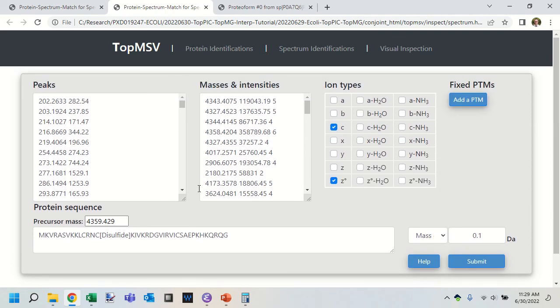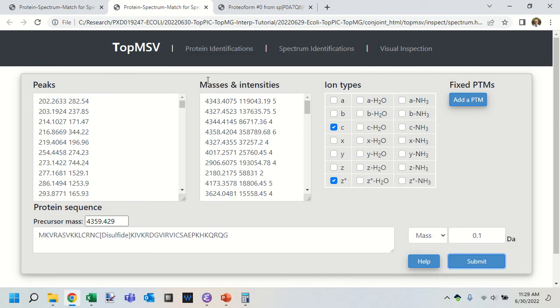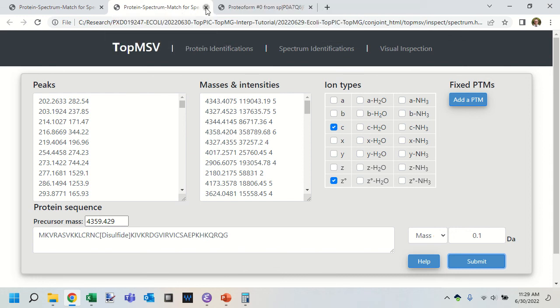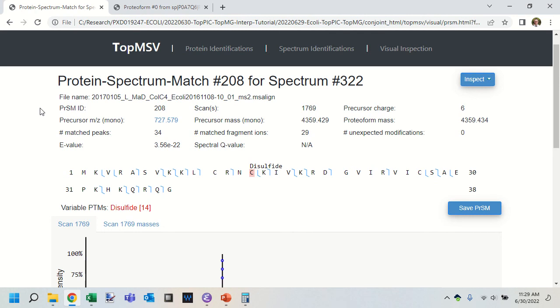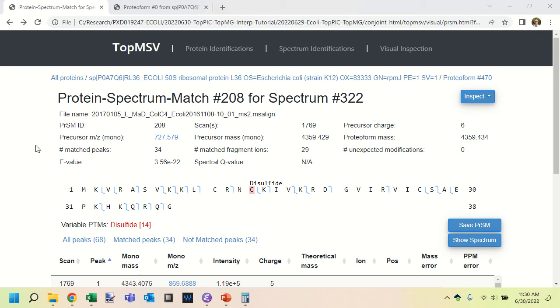We can even do things like, oh well, it doesn't like my PTM names. That's okay. It even allows us to play what-if games. What if we change a modification so that it's no longer there? Change our interpretation of where the PTMs are located, etc. Okay, so that's quite a lot of information.